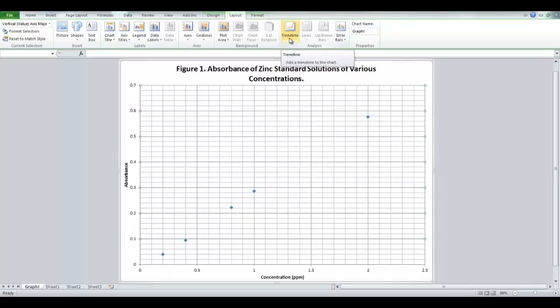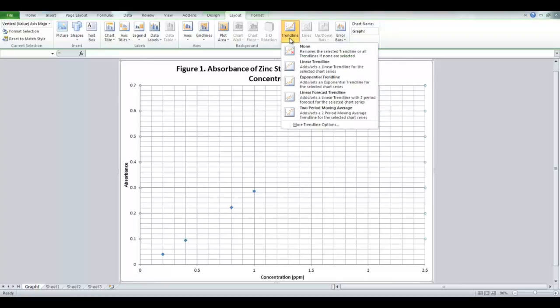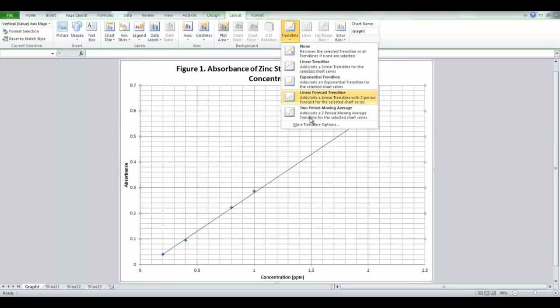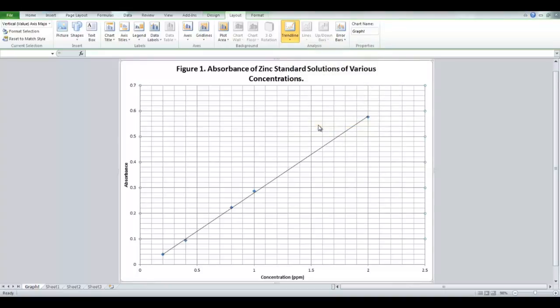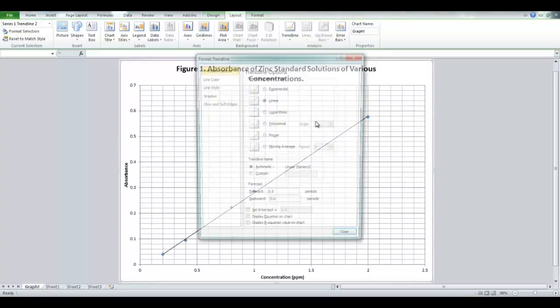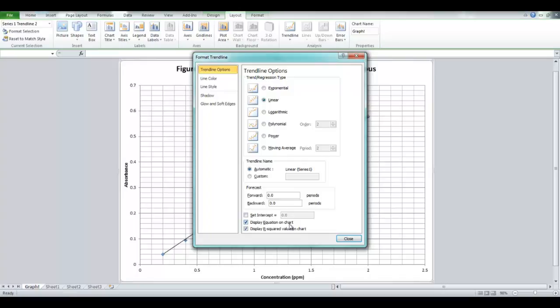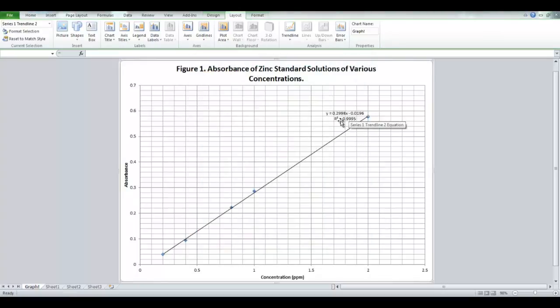Next, we'll add the trendline. So simply go trendline, and linear is what I want in this case. So I click on it, and it automatically puts it in. You can go more trendline options at the bottom. Because you will want the equation of the trendline, as you can see at the bottom of the options. Display equation and the R squared value should you need it. Check the boxes, click close, and it'll put it in there for you.